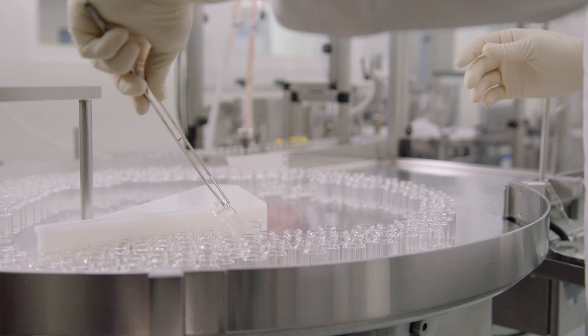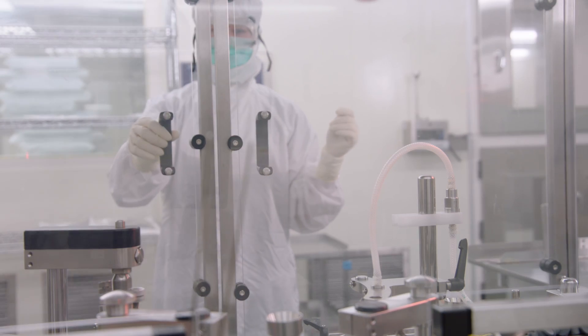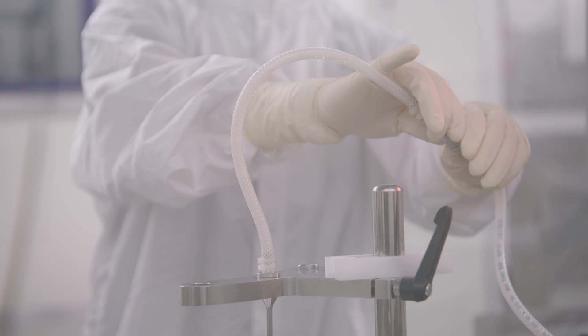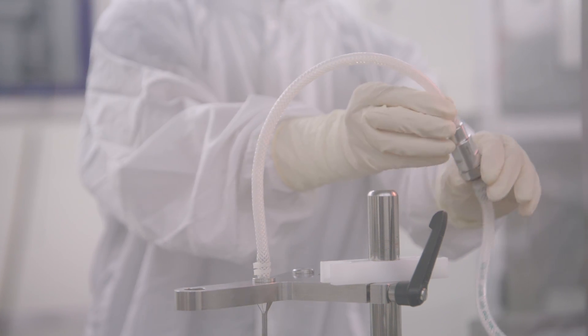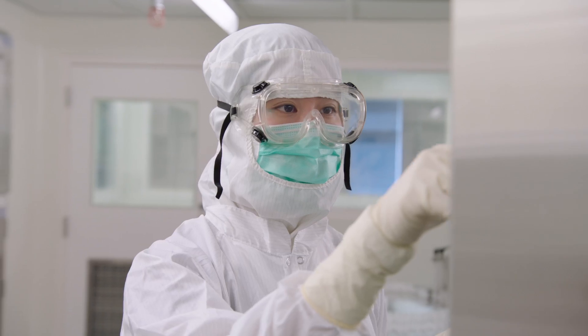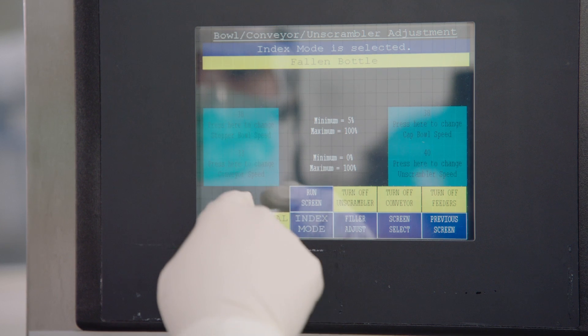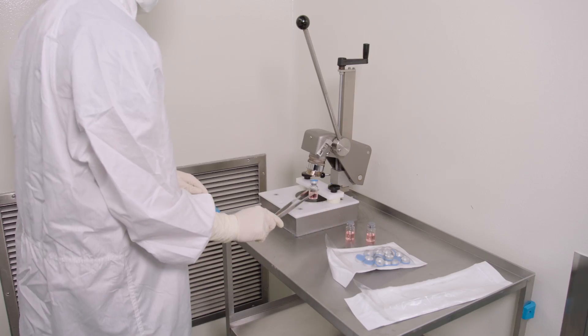Workers in a sterile, non-surgical environment, such as a pharmaceutical production plant, must carefully don gloves the correct way so that they remain contamination-free and ensure product integrity. The goal is to make sure the exposed part of the glove is only in contact with sterile or clean items.